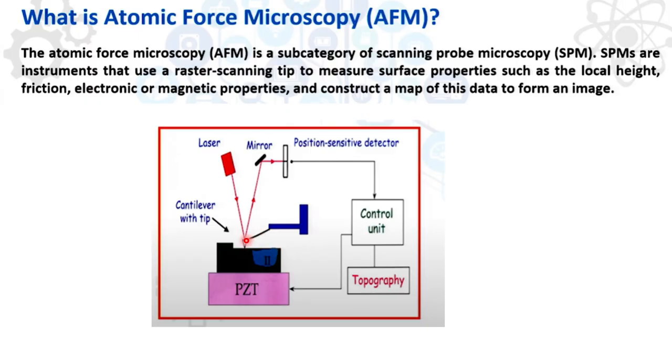And you can see how it is probing; it is not constantly going through this way. The cantilever means, since in case of AFM we are measuring the force, based on that the cantilever will bend. This is the cantilever. What is the cantilever? It is, of course, a metal body, and here this is the tip.